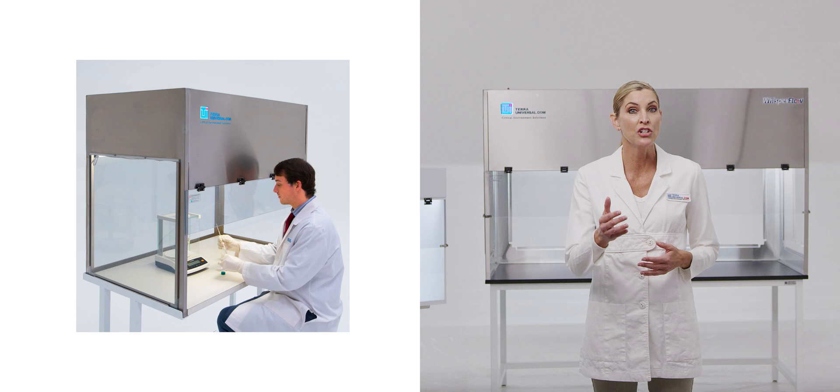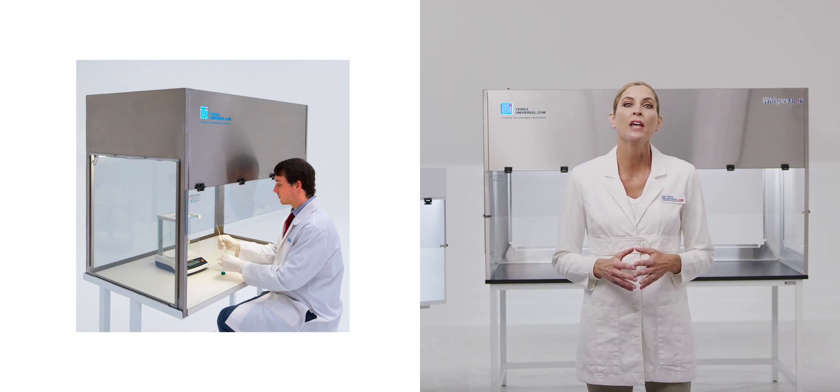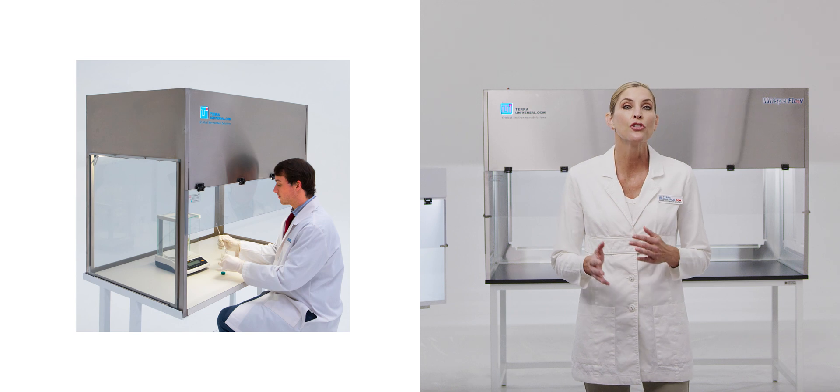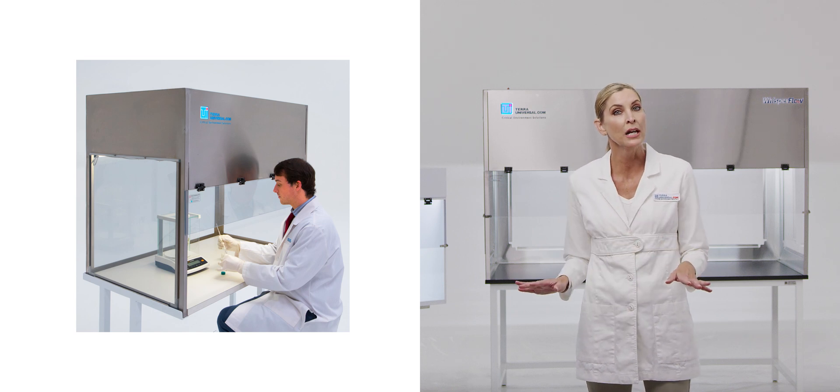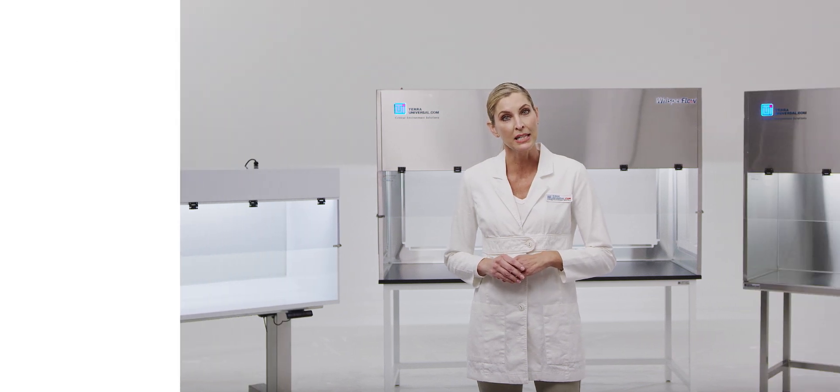For powder weighing, packaging, or milling, Tara's Benchtop ductless ventilation hoods use a reverse flow fan to draw contaminants away from the work area and through a HEPA filter for safe indoor release.